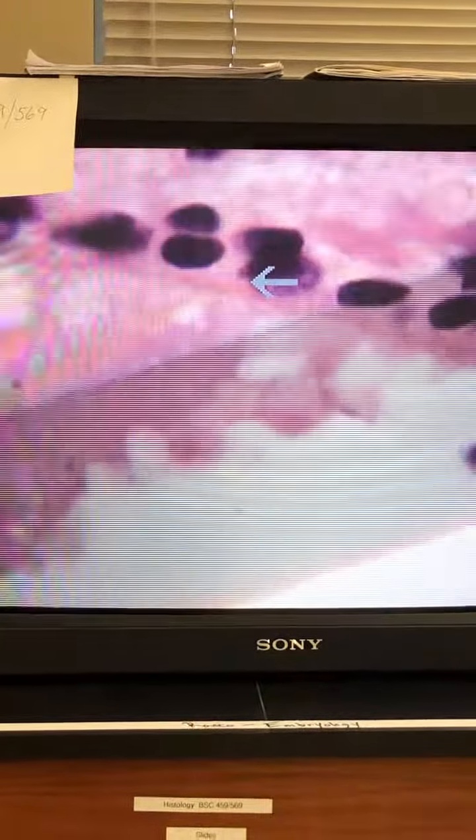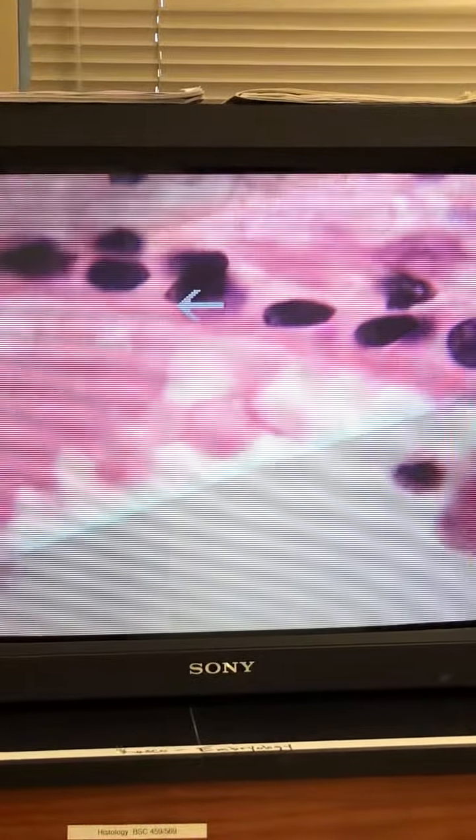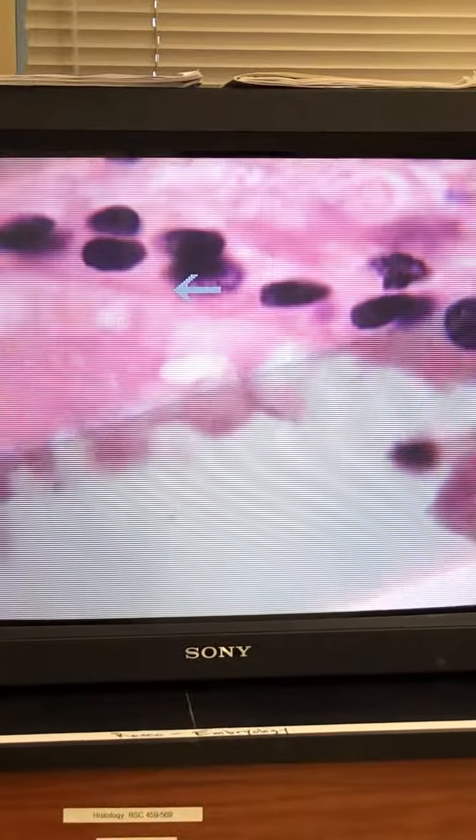you could see the microvilli. They're not microvilli. Well, there's cilia and microvilli. This is sort of like, you can see like fringe right here. That's the microvilli. The villi would be more apart.